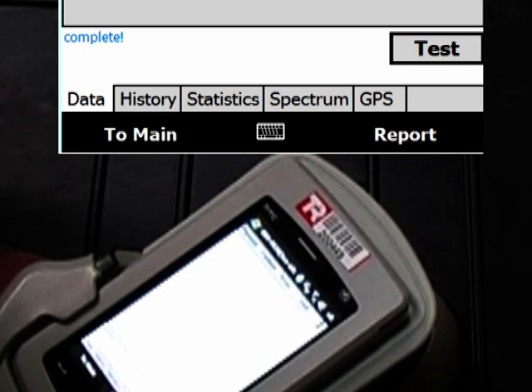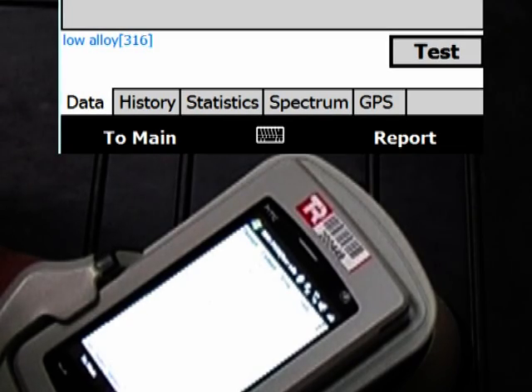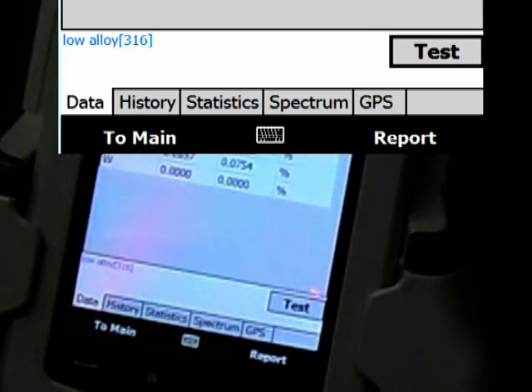You can hear the bell when it's complete. That's the results — and it says here that it's 316 stainless.